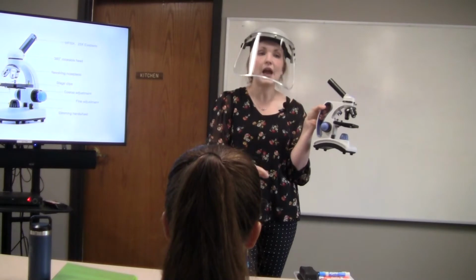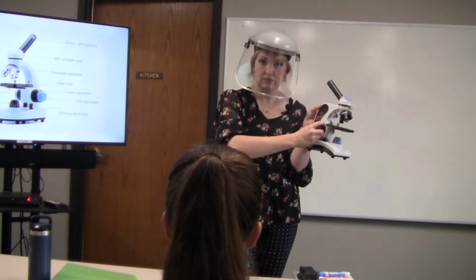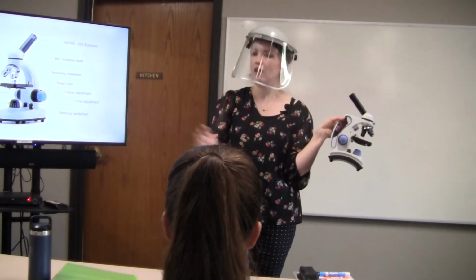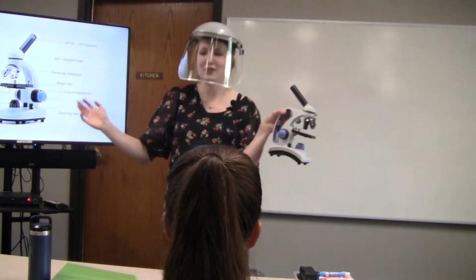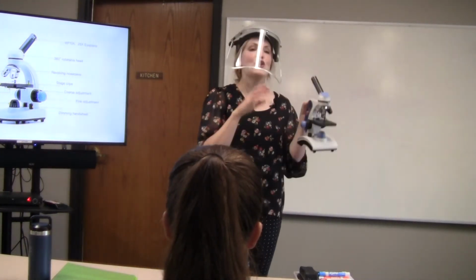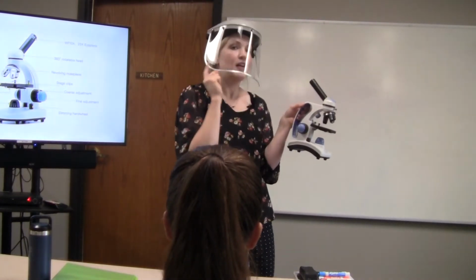The error that a lot of people make is that they will use coarse adjustment then to get themselves refocused, and then you get lost. You've moved the stage too much, and you get lost trying to get it refocused. Don't use the coarse adjustment except for at 4 times.